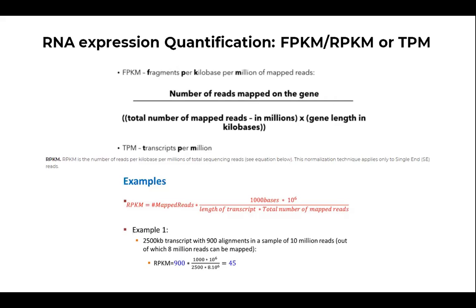How you can quantify it is indicated by this formula. Here first the total reads are counted in a sample, then they are divided by a million, and this is the per million scaling factor. Then this divides the read counts. It normalizes the sequence depth, giving you reads per million.